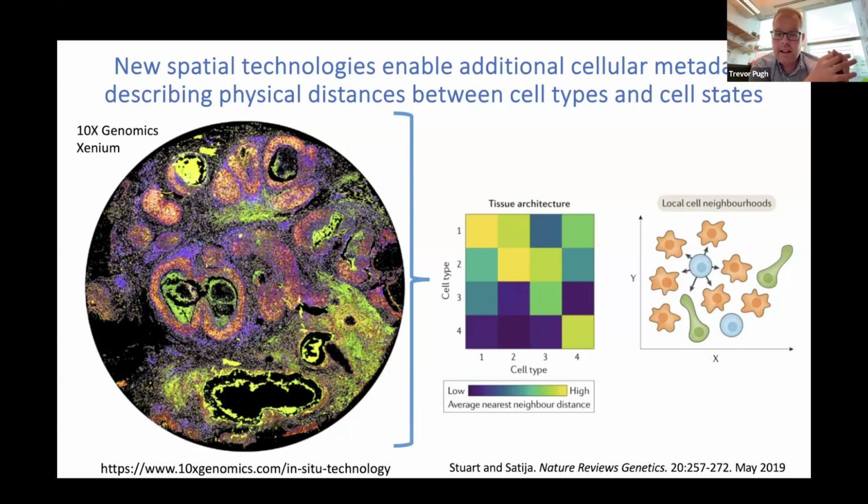So once you've done your single cell sequencing analysis, you now ask questions that sit on top of it. How far are certain cell types from each other? If a cell is expressing this type of pathway, how far is it from another cell that expresses a different pathway? So while the visuals are really quite striking, computationally, it's really just another table. And that table is essentially cell by cell, and the units of the table are how far you are away from that cell. And then you can reconstruct that table into striking visuals like the one on the left.